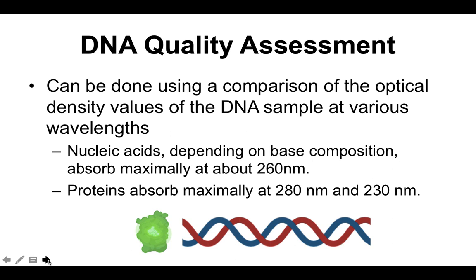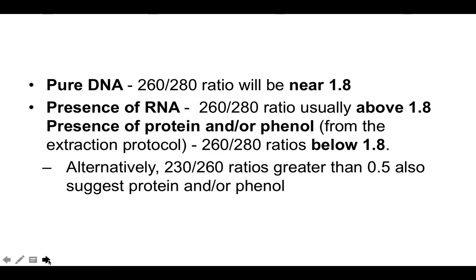On the other hand, proteins, which are the other molecules we expect to see in the cell and we expect to be present in our DNA extraction steps, and eventually we need to remove, absorb maximally at 280 nanometers and 230 nanometers. Now, here, let's take a look.